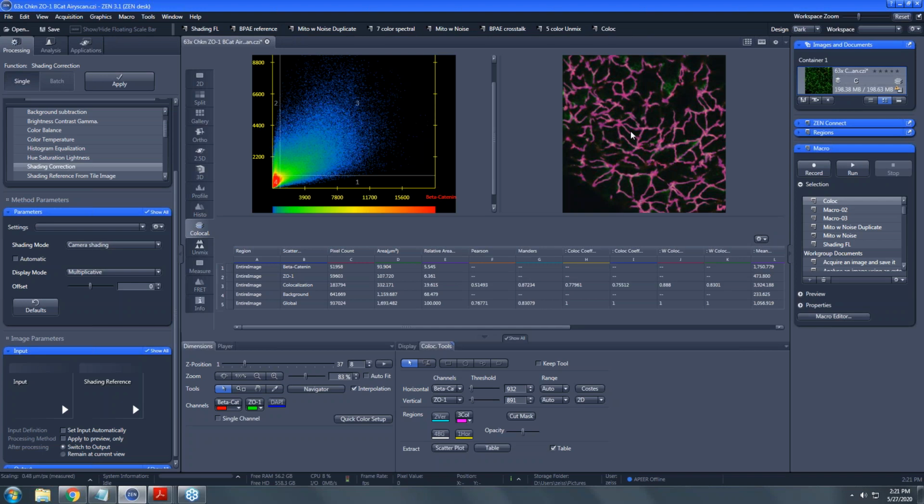So the only way that this makes sense is if we have two different systems that we want to look at. System A, where we have maybe a wild type, and system B, where we have a mutant, and we want to determine the degree of colocalization, and then we can compare these correlation coefficients, and then we have some meaning associated with them. One is greater than the other.